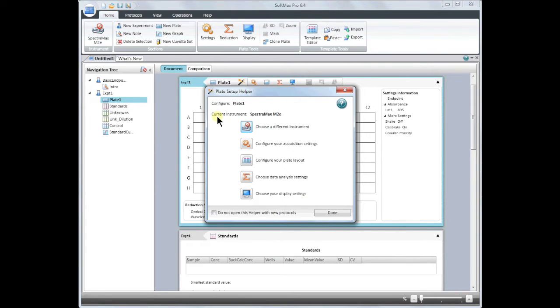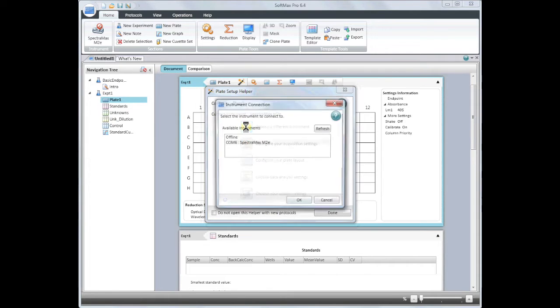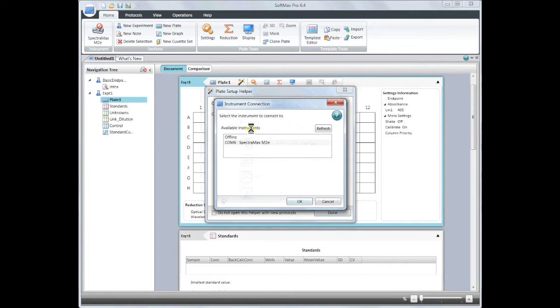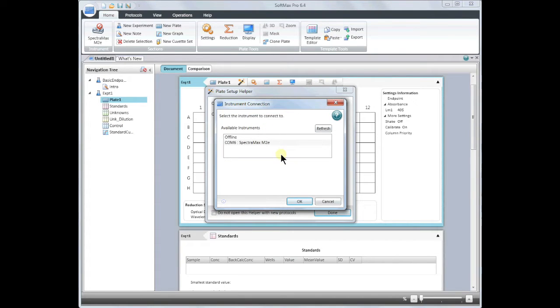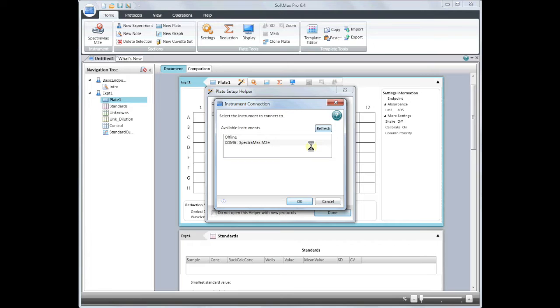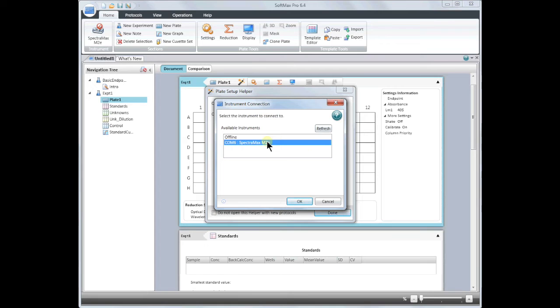Once you confirm that all the cables are plugged in and that your instrument is on, click on the button to choose your instrument connection. If you do not see your instrument appearing in the available instrument section, you can click refresh or power cycle both your instrument and the computer to establish a connection with your instrument. Once you find your instrument connected, click OK.